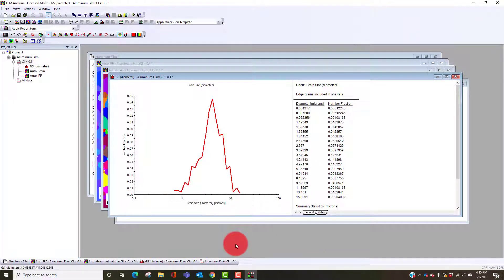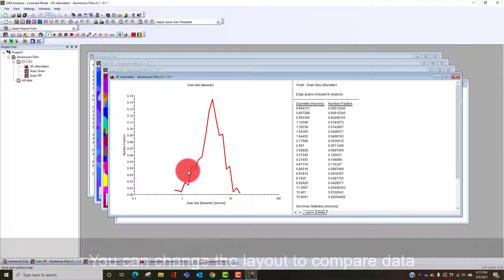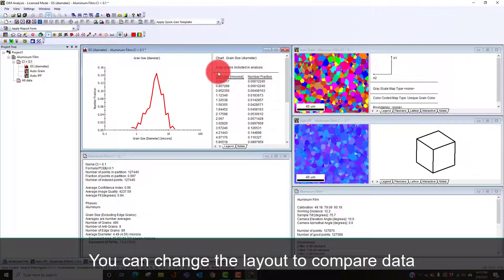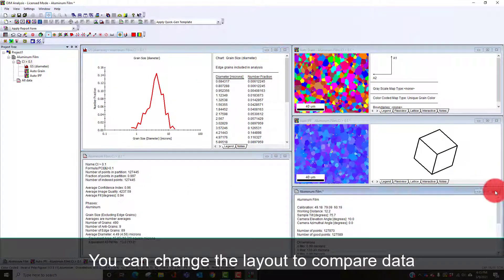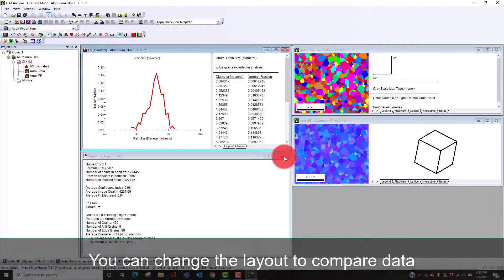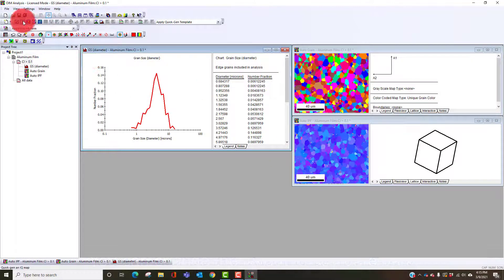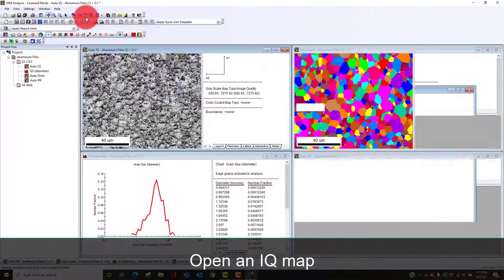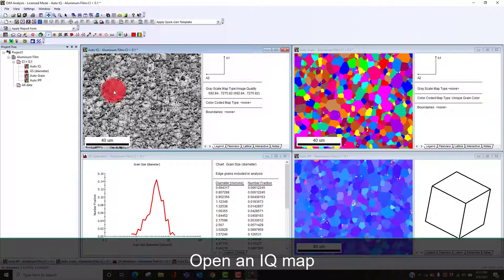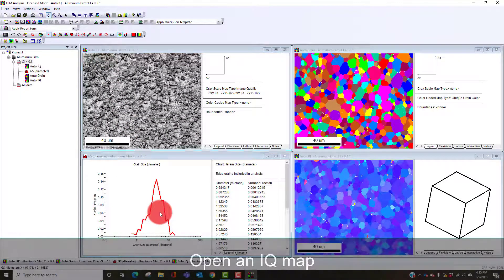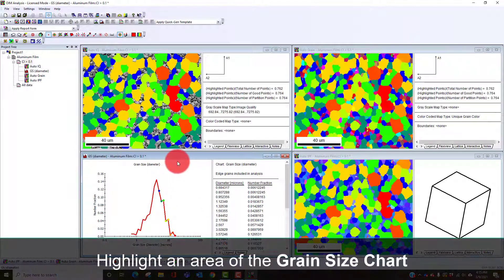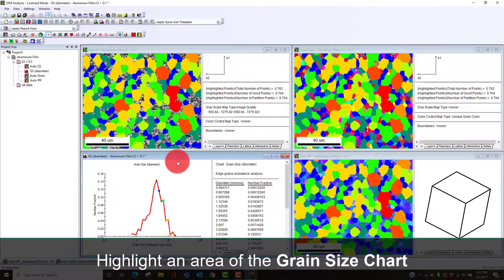If we wanted to see the effects I can put these next to each other. I can close these and I'll bring up an image quality map. If I want to see where just the large grains are I can do some highlighting here and it will show me. This kind of shows the effect of the numerical things.